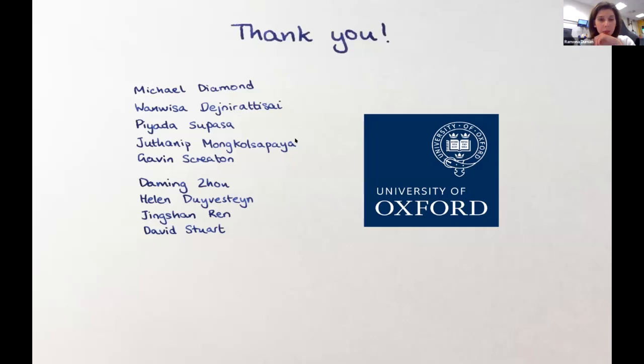Okay. Next one: as usual, awesome handmade graphics, wonderful talk. Sorry, I missed this point. Does cluster 4X work with data that have different unit cells? Also, I see it nicely working on antibodies. Do you think this method can be applied to small molecule drug screening?